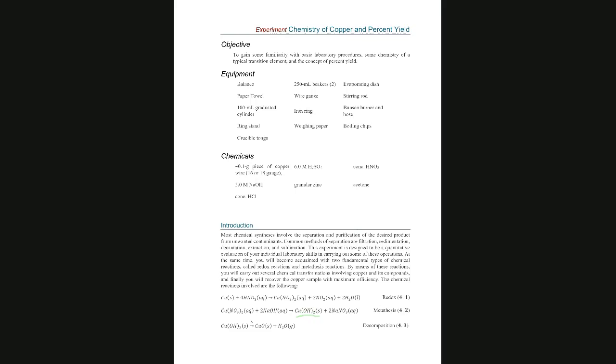And that is a blue precipitate. You don't need to know this because you're not doing that in the lab, but you will need to learn those reactions, and you will be given the data, so you will know what the color is. So we observe a blue precipitate of copper hydroxide that forms in reaction 2.